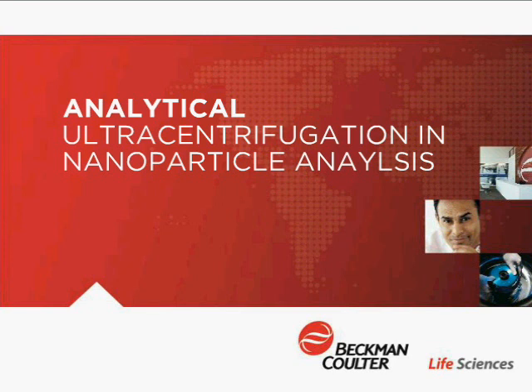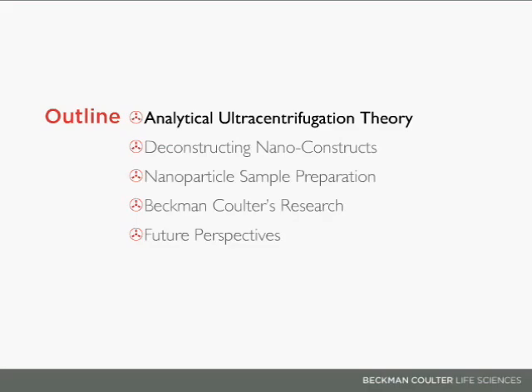Then we'll discuss deconstructing nano-constructs and how analytical ultracentrifugation has been used in recent literature to really probe the underlying structure of nano-constructs, nanomaterials made out of several different nano species. We'll continue on with general tips and tricks for nanoparticle sample preparation, as well as our current research at Beckman Coulter, and then just a few future perspectives.